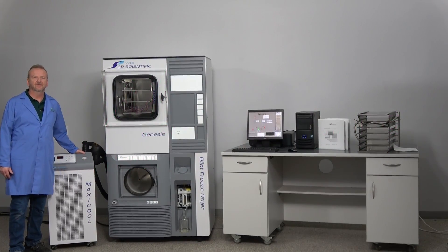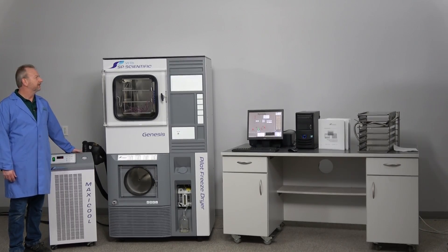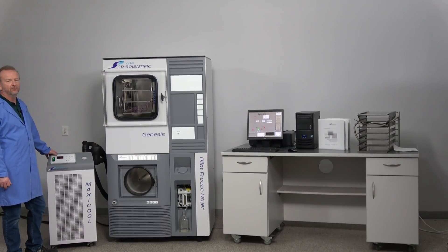Hi, I'm Rich at New Life Scientific. Today I want to show off a beautiful machine — this is a 2017 SP Scientific Genesis pilot freeze dryer. It has a few options that I want to go over, and it has very few hours on it.